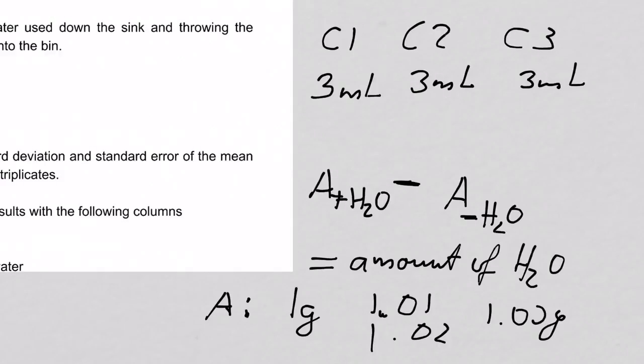What you then want to do is present your data ideally in a table and also as a sort of a graph. So, for example, conventionally what we do when we draw a graph is, on the x-axis we plot the thing that is under our control, that we can change. So we would plot here milliliter. So 1, 2, 3 milliliter.